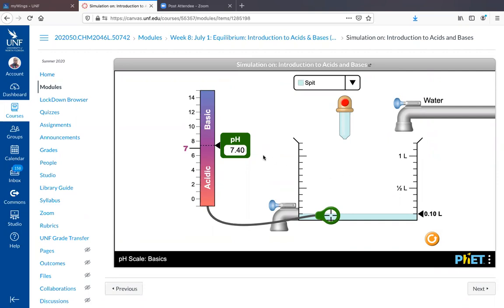What I'll do is you'll have to add water, not this tab right here. This is for the reagent or substance. The further you push this, the more H2O. This is for dilution. It's just going to rise slowly. You see how it's going to rise? You want to end up at 1. If you overshoot, you have to start over again.